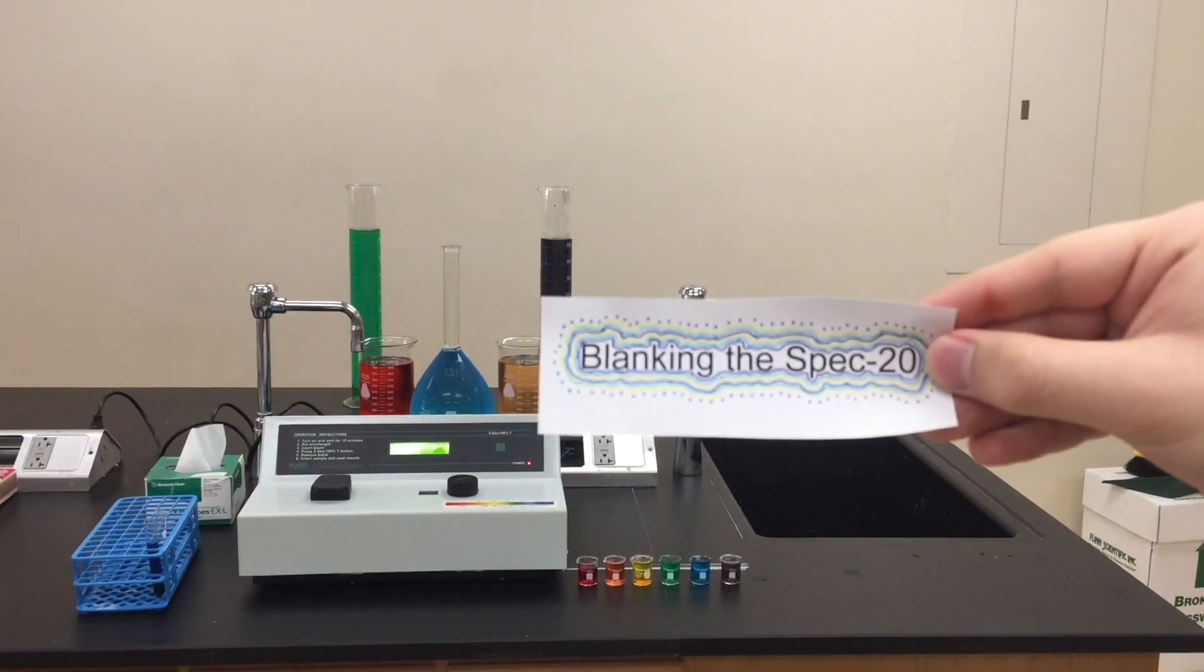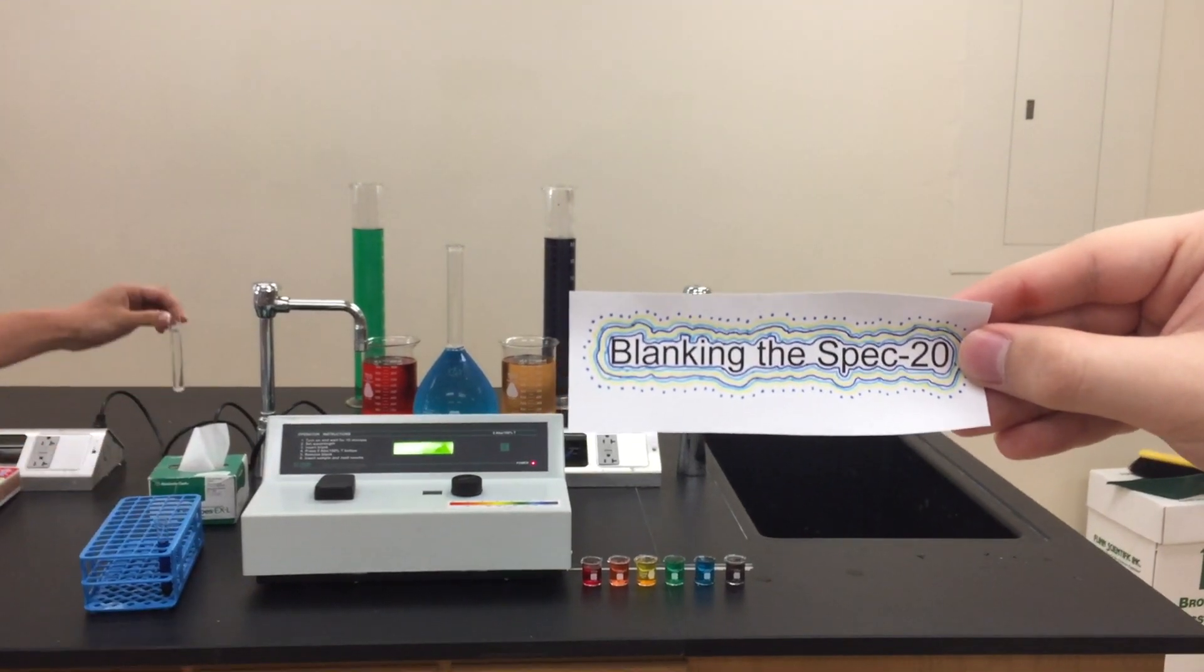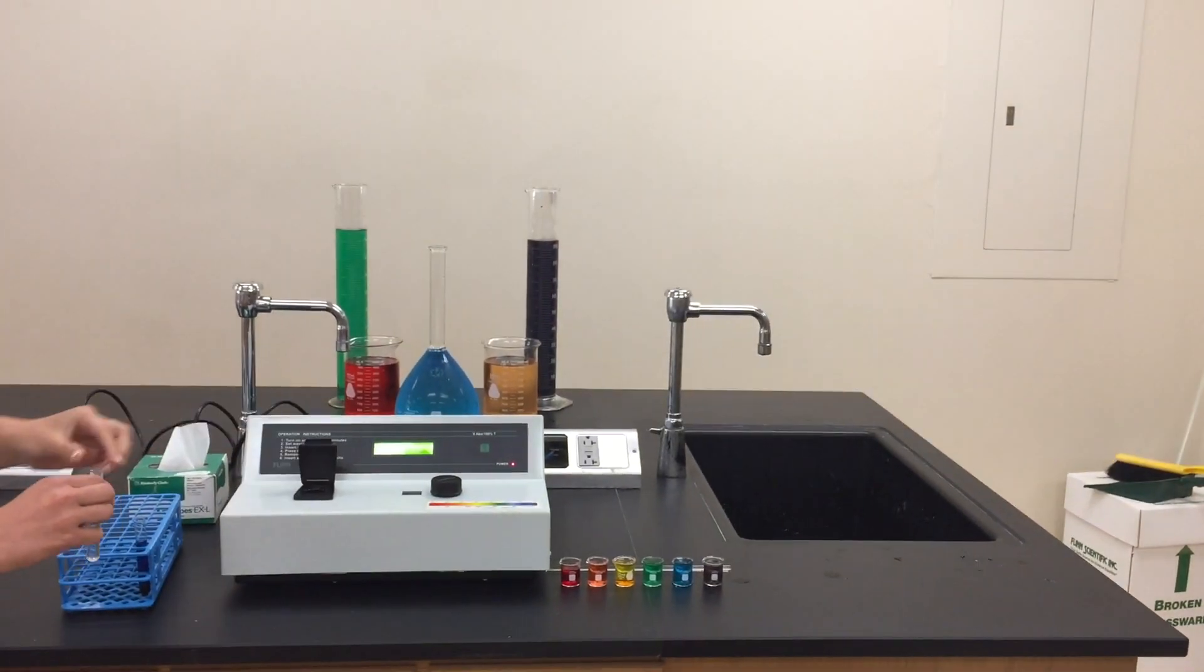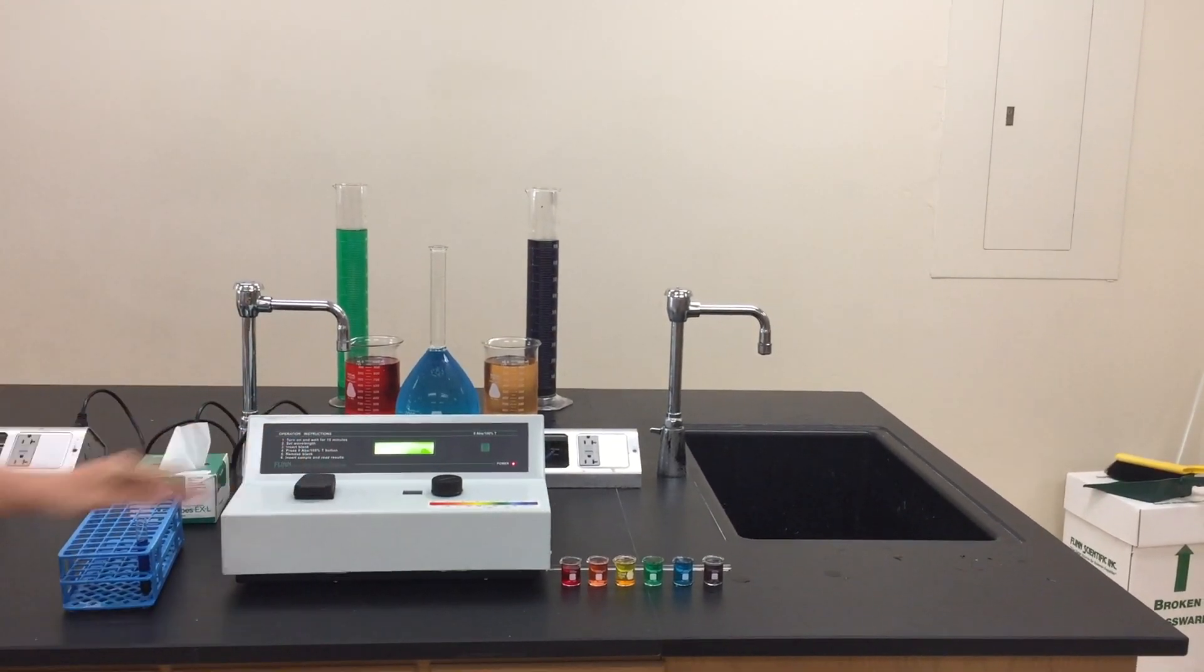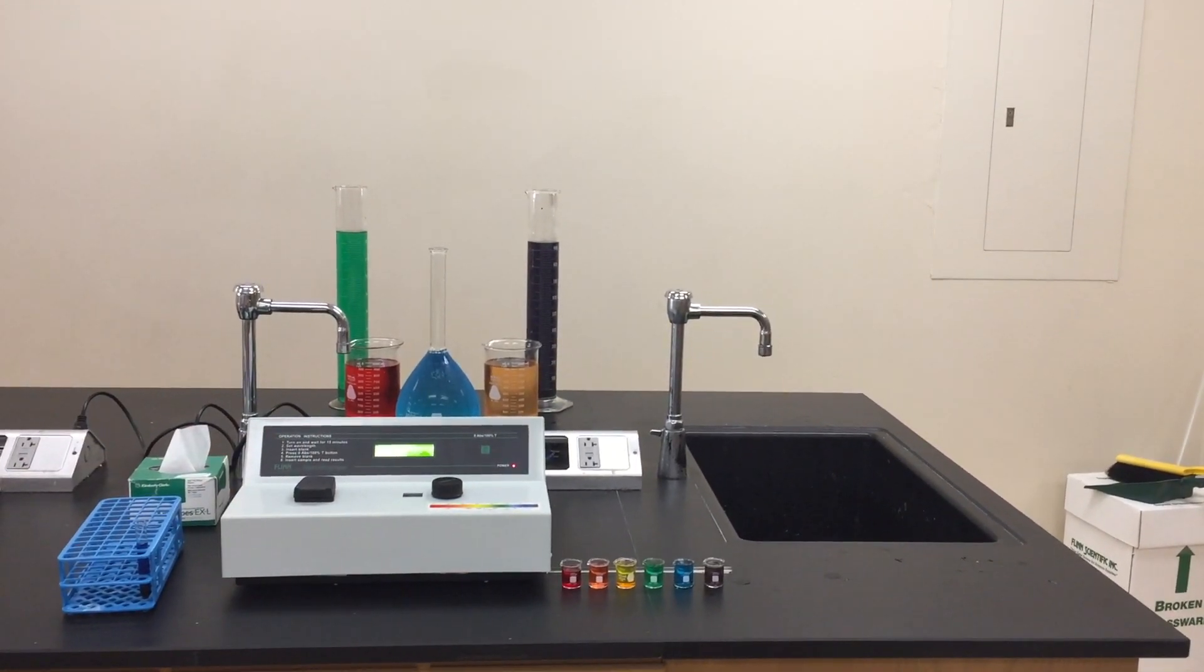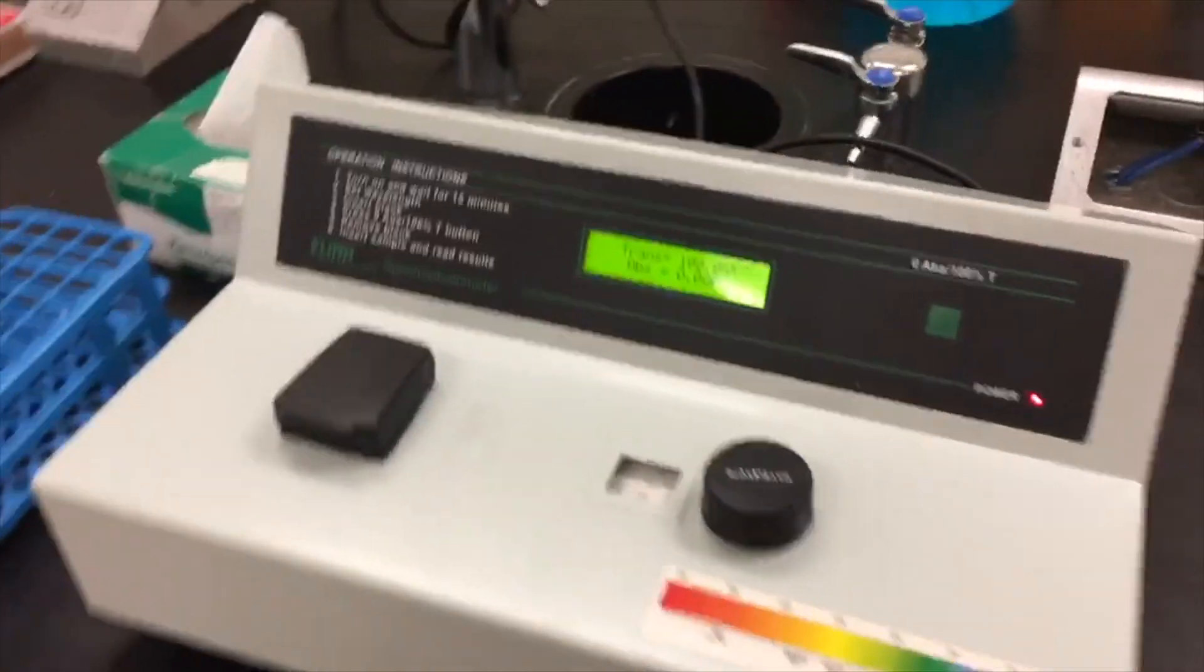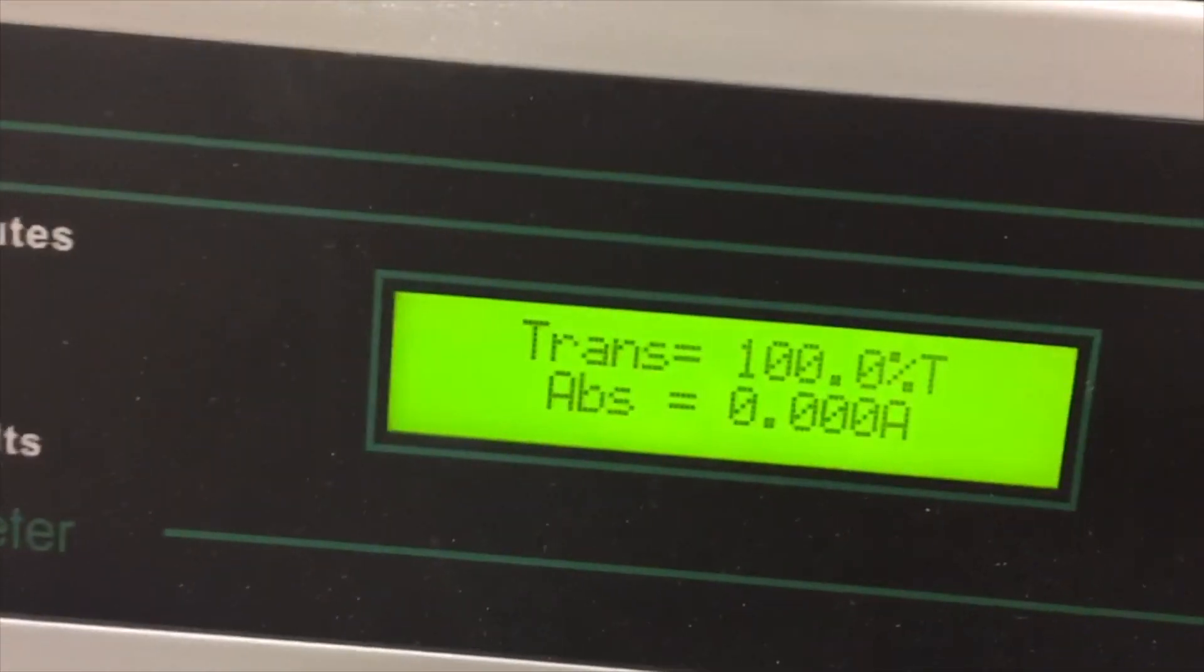To blank the Spec 20, fill the cuvette about three-quarters full of water and place it in the sample holder. Then use the calibration button to set the absorbance to zero. You will need to do this before every new solution.